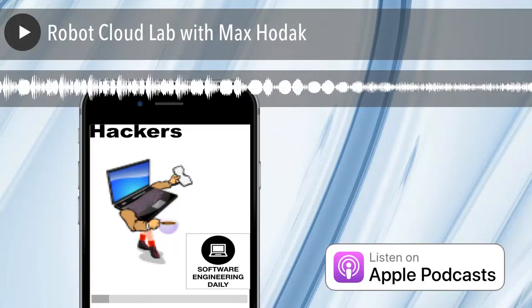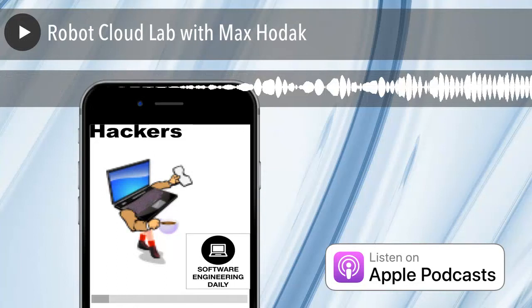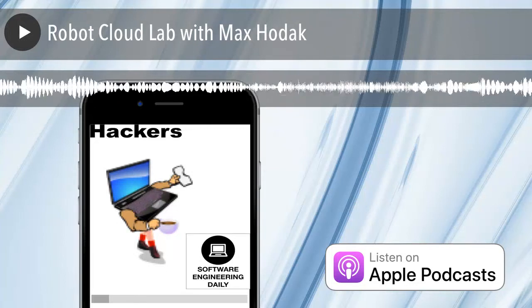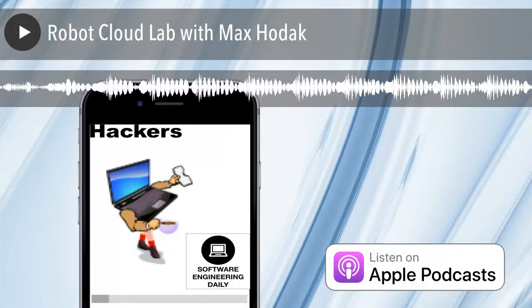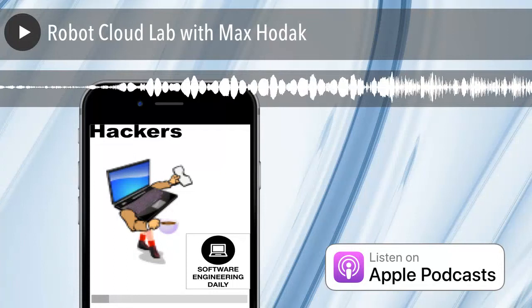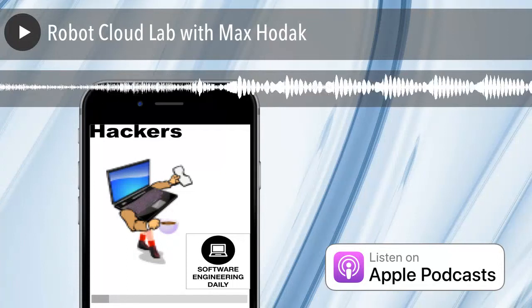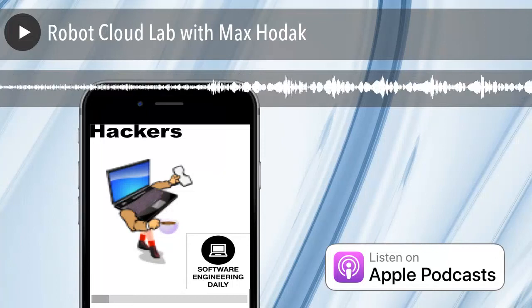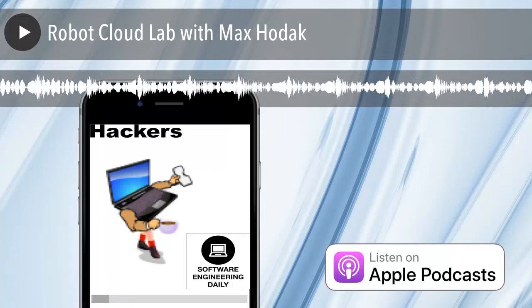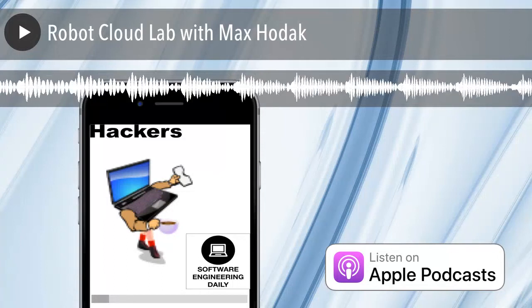What are some of the procedures that still cannot be done with Transcriptic? What are the big bottlenecks that you're focused on right now? So when we started, we were focusing more on synthetic biology as opposed to drug discovery. So this is working more in bacteria or algae and designing metabolic pathways, so designing genomes to run interesting reactions, and we've refocused away from that onto drug discovery. So now we're working on things like thinking about how do we automate cell culture and tissue culture, and bringing on different types of detection instruments. That was one of the big changes that the company's undergone over the last year or so.